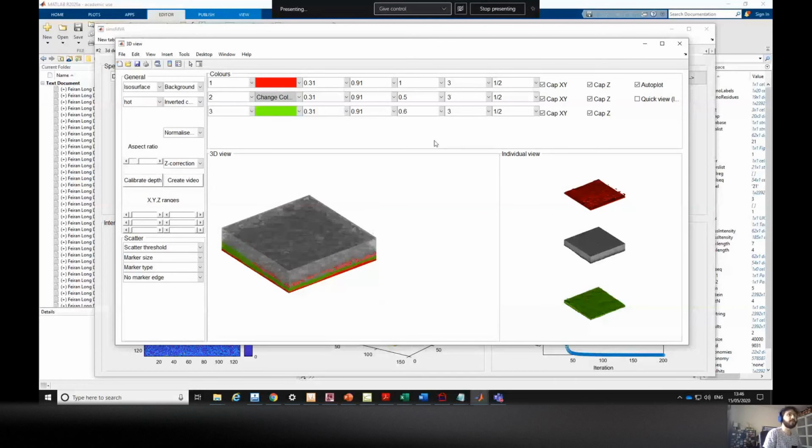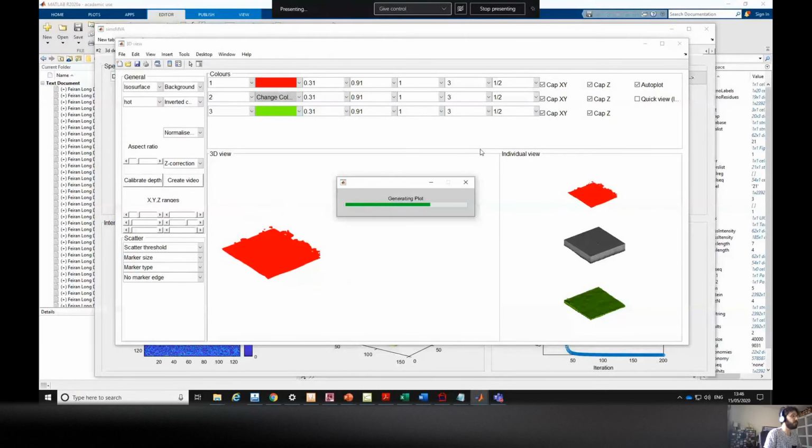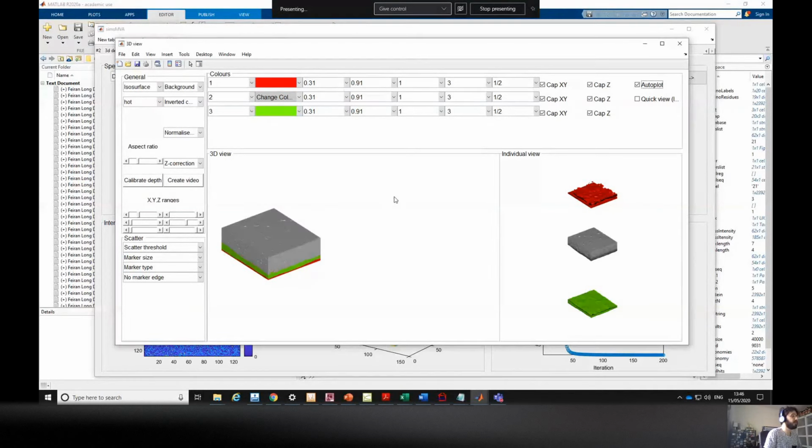Those sliders here remove the transparency. These sliders are for cropping the data. So then you look inside. This one, yeah, because again, each layer is quite homogeneous. You don't see anything when you cut inside. You don't notice any difference.